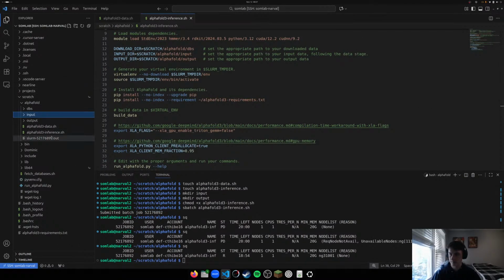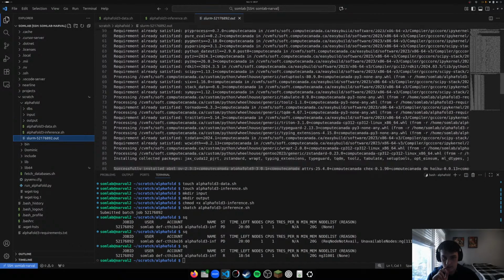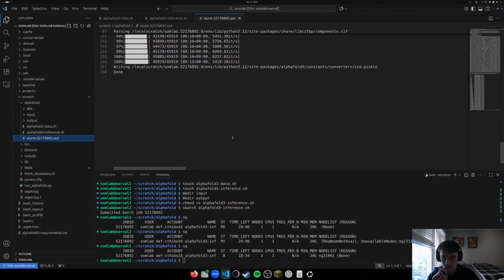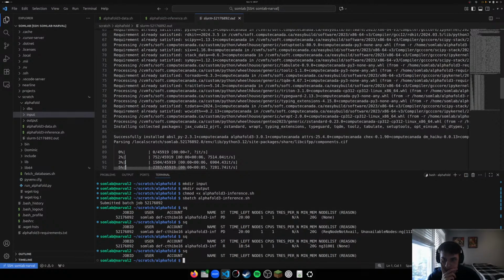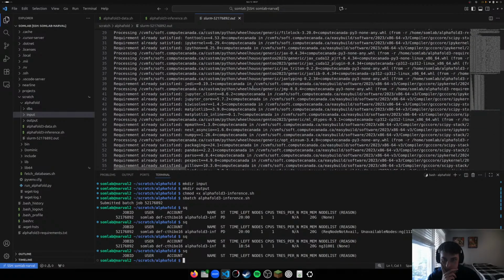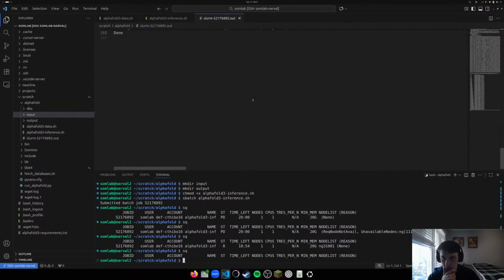Okay, so we're running. It took a lot less time than I thought. It's gonna be like no input or something. But did it work? I think so far so good, y'all.